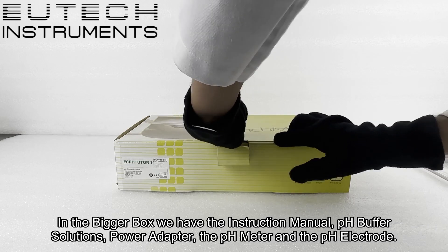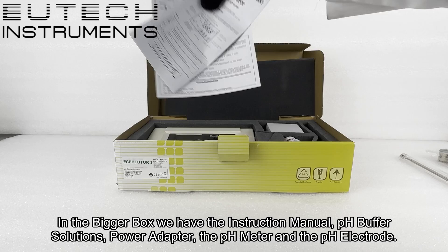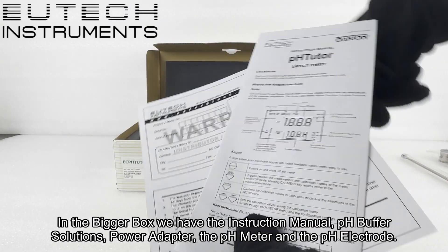In the bigger box we have the instruction manual, pH buffer solutions, power adapter, the pH meter, and the pH electrode.